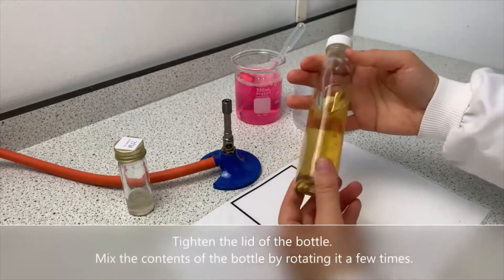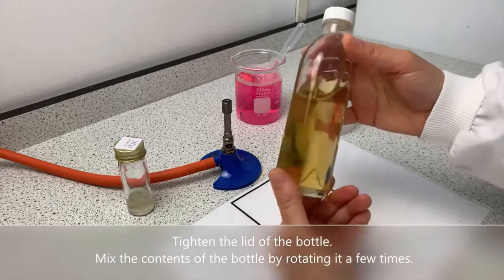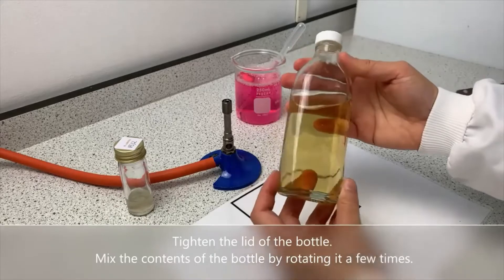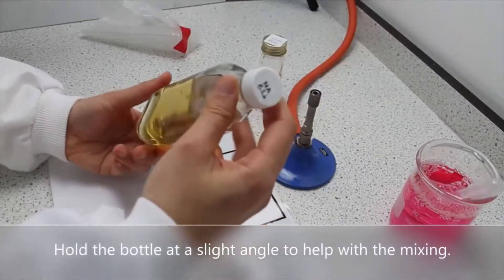Mix the contents of the bottle by rotating it a few times. Hold the bottle at a slight angle to help with the mixing.